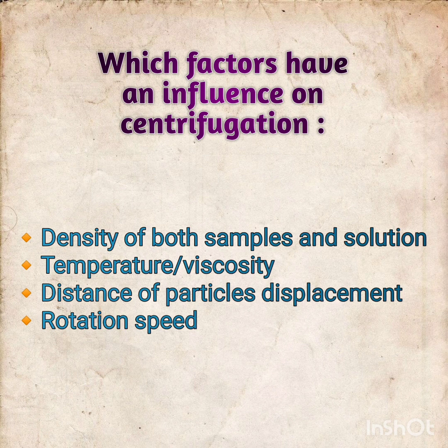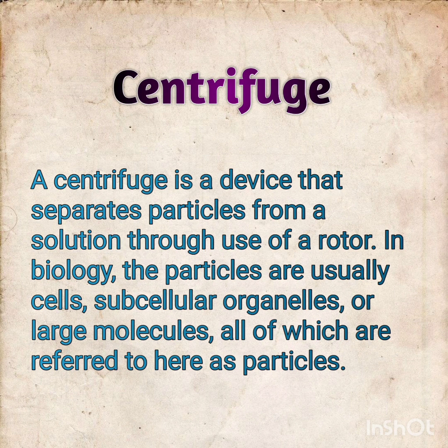Okay, so what is a centrifuge? As we have studied earlier about the centrifuge machine, a centrifuge is a device that separates particles from a solution through the use of a rotor. What is a rotor? A rotor is something like a motor which spins at a definite speed in a circular motion. So through the use of the rotor, the centrifuge device separates the particles from a solution. The particles may be simple cells, subcellular organelles, or large molecules, all of which we refer to here as particles.